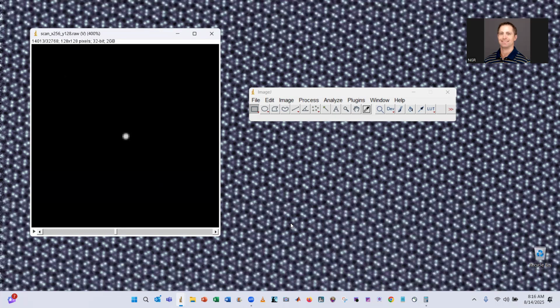Again, if the data set was smaller, we could have done that directly. We could have done that with this data set actually, but with a full data set, unless you have enough RAM to create a stack that large, you won't be able to do that. So just something to keep in mind. It's important, obviously, to have proper orientation of the DPs relative to the image.